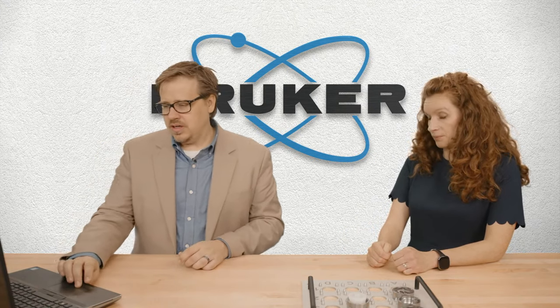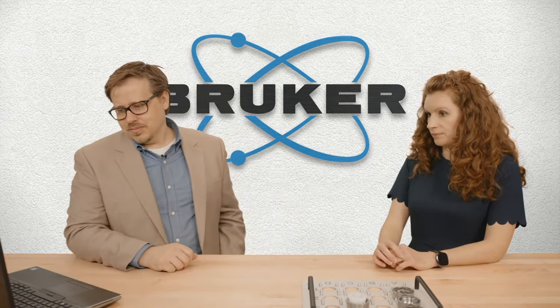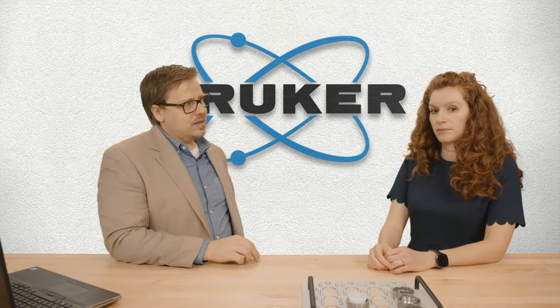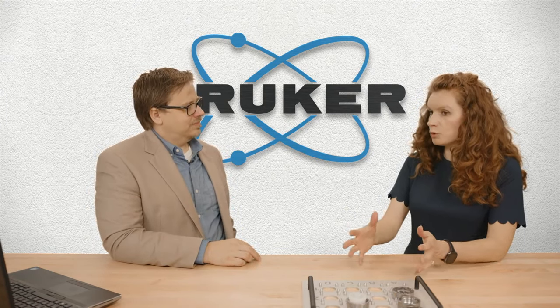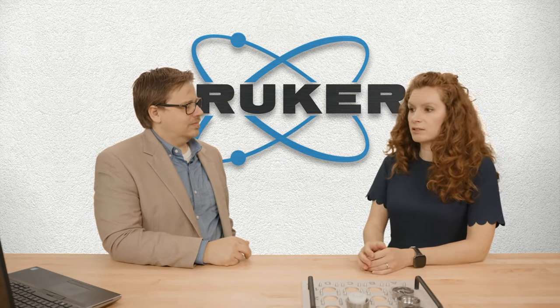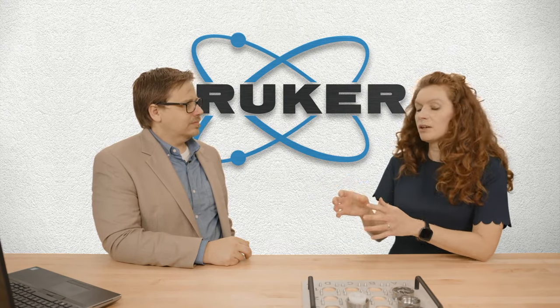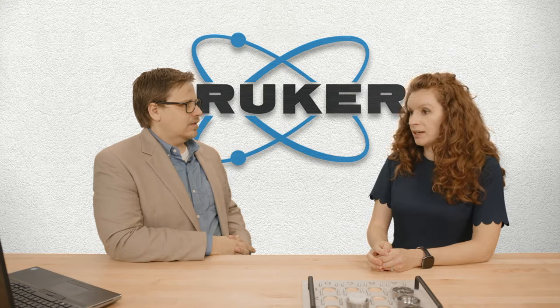Okay. So, speaking of matrices and specifics like that, I have a question that came in from Kelly. Can this be used to measure organic matrices? Yes. In fact, one of the big new areas that we're breaking into is measuring food and feed. And most of this is measured with EDXRF because it's actually a very simple analysis. We're not measuring the organic part, right? We're measuring what traces are in there, what nutrients are in there, and it's a very simple measurement.